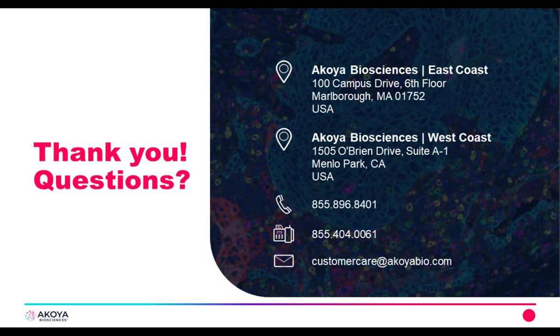Now, can the output of the CODEX processor be a multi-layer TIFF? Chrissy, this is Diane. I can answer that. We've been able to process our images in a way that the CODEX processor itself will stitch together an image, depending on the type of scope you use. When you open that image in the ImageJ suite, you're able to manipulate it just like any image in ImageJ. You can export it as an OME-TIFF, or if you prefer another file format, you can do those manipulations and export directly from ImageJ.